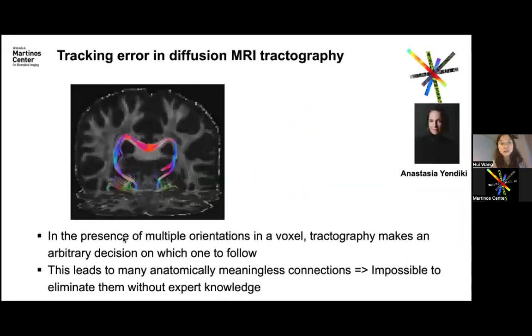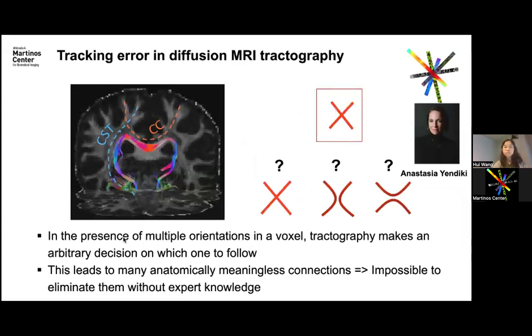So then I probably just want to skip this one, just to say that over the past 10 years we really tried to use PSOCT to validate and guide diffusion tractography methods, because, as you all know, a single voxel is very big and includes multiple fibers with different orientations, so you have no distinction between crossing and kissing fibers from different directions.